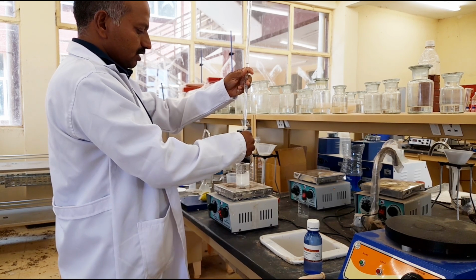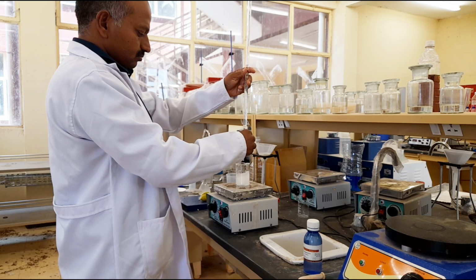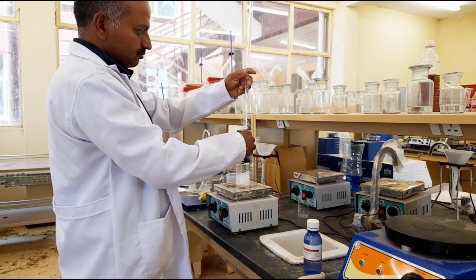The color is still colorless only. The acid is not neutralized.